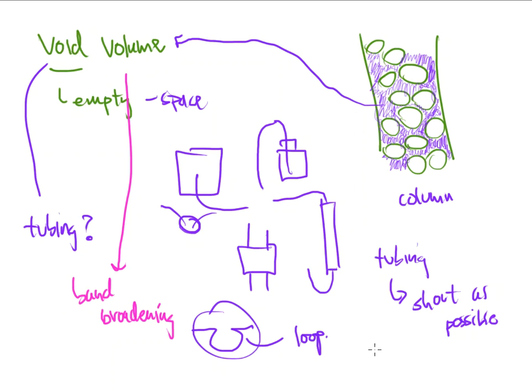Also, when I check for tubing, I want to use tubing with very small internal diameters. Narrow little roads is what you want them to be traveling on. You don't want to give them a 10-lane highway. We're not Los Angeles here, okay? What we want to give them is something like a one-way street. We want something that's super narrow because we can control the traffic a little bit better. They can't venture off of the road. They're constricted on the flow path that they're going to be in, and they've got to follow the route.